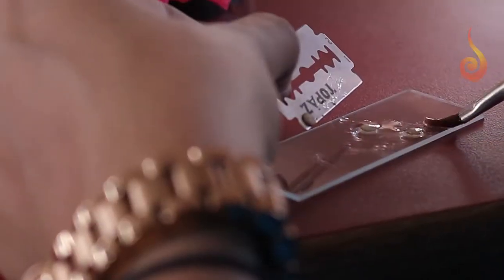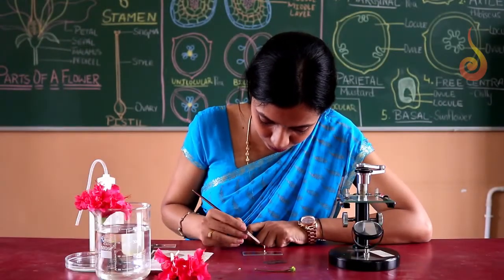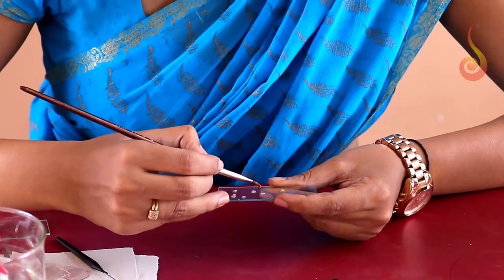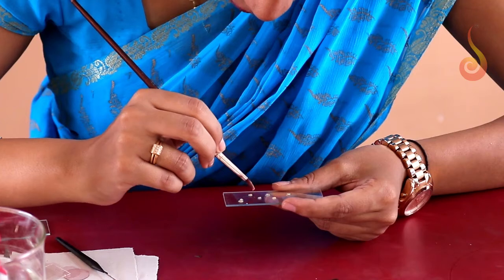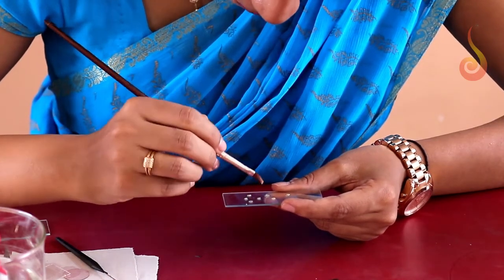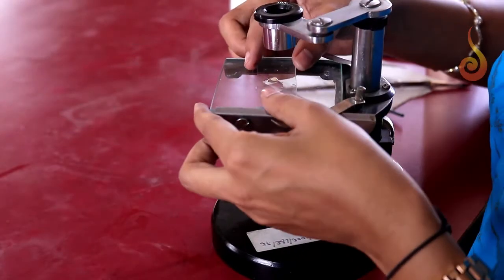I am going to put it on the drop of water that I have taken in this slide so that I can examine them better. I have taken around 6 sections here, of which I am looking for the thinnest and the one in which the locules are very clearly visible. I am now going to focus the best section under the dissection microscope.